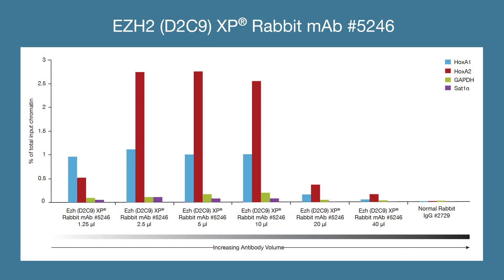The optimal amount of antibody to use in a ChIP assay varies, depending on the antibody's affinity, sensitivity, and specificity. More antibody is not always better. As you can see in this titration data, both too much and too little antibody decreases ChIP signal. For most ChIP-validated antibodies, half to two micrograms of antibody generates an optimal signal-to-noise ratio in the ChIP assay.